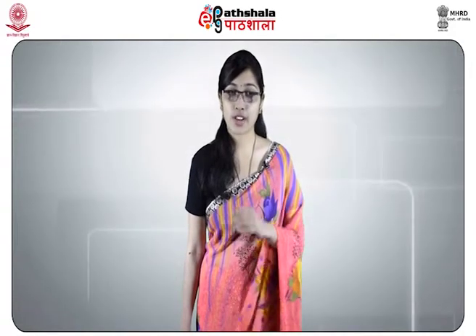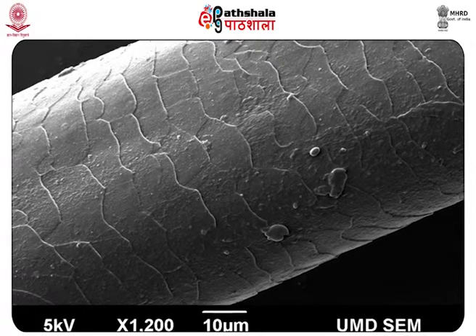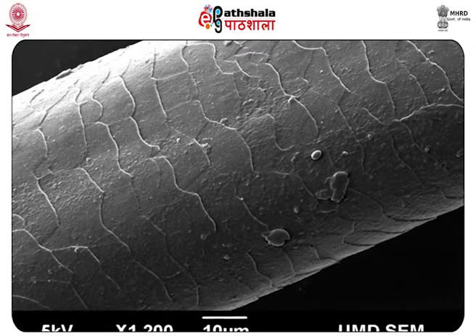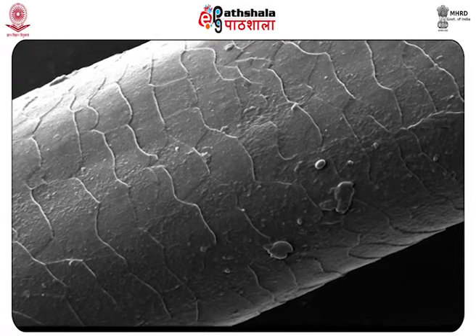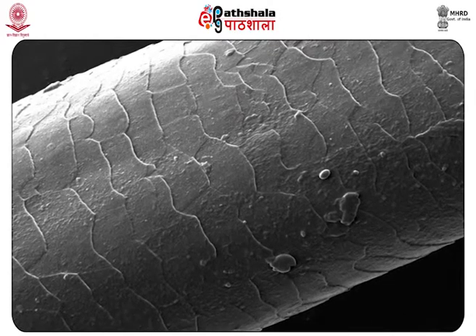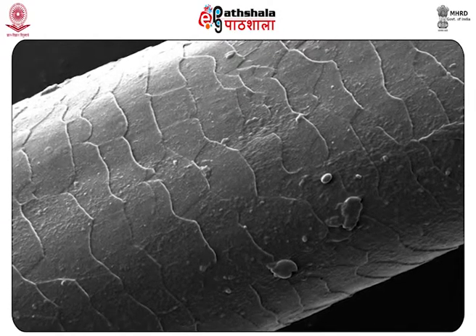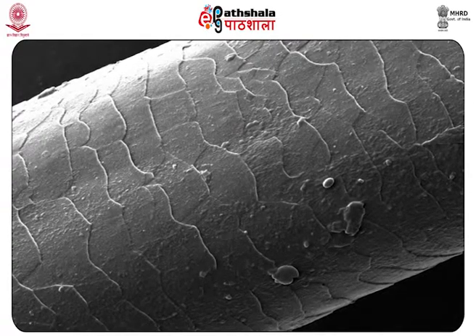Then next comes the transmitted light microscope. For identification and examination of hair of high quality, the transmitted light microscope is required. The objectives and the eyepieces should permit observations in the range of approximately 40x to 400x.